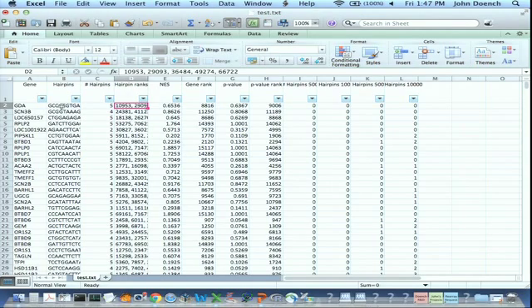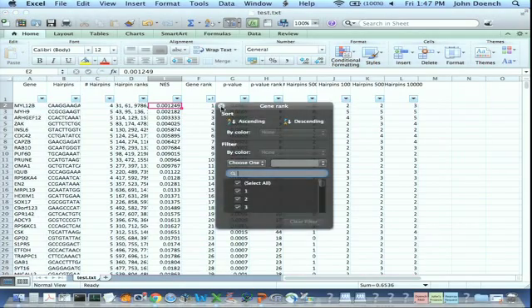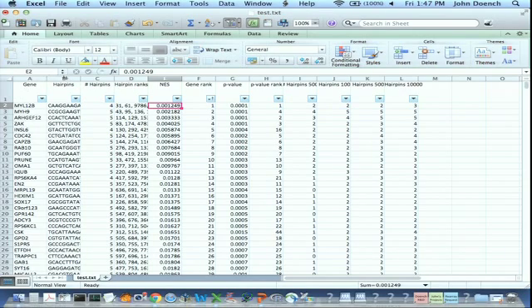meaning the 10,953rd hairpin had this first sequence. It tells you the normalized enrichment score and the gene rank. This is what we actually care about. So here we can sort by gene rank. And you can see that in this particular screen, the number 1 scoring gene was MYL12B. The number 2 scoring gene was MYH9.